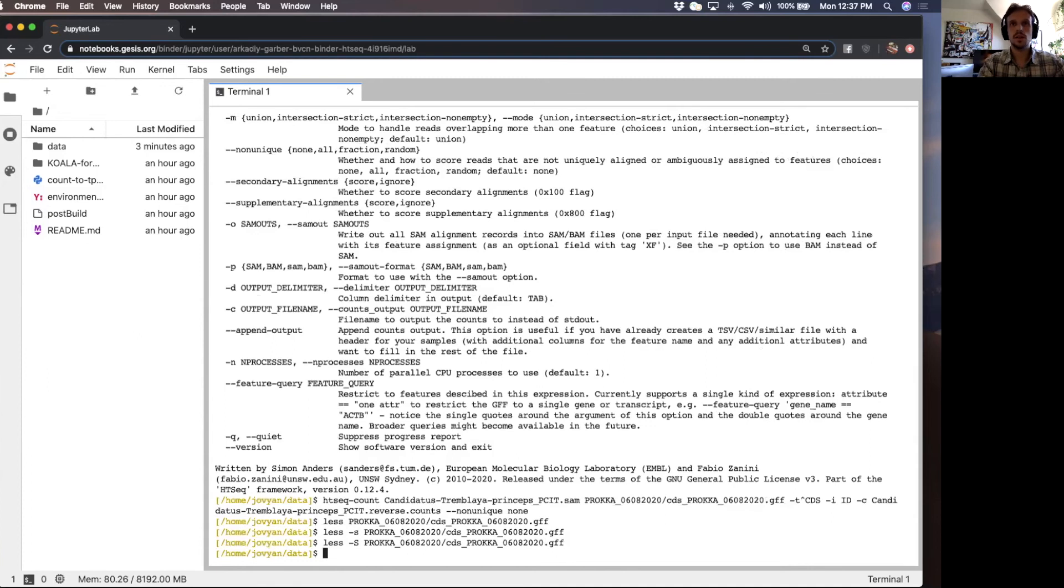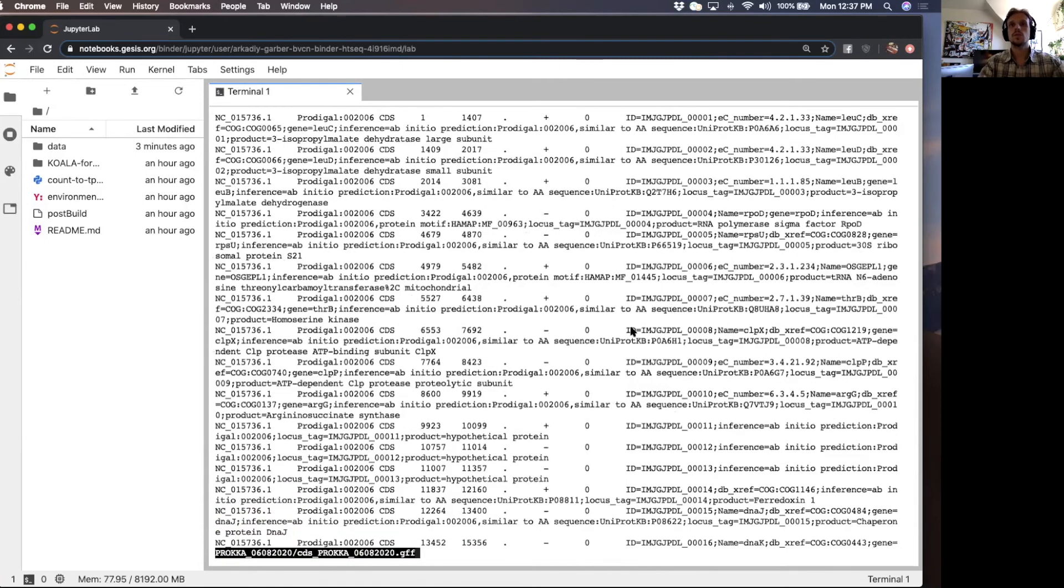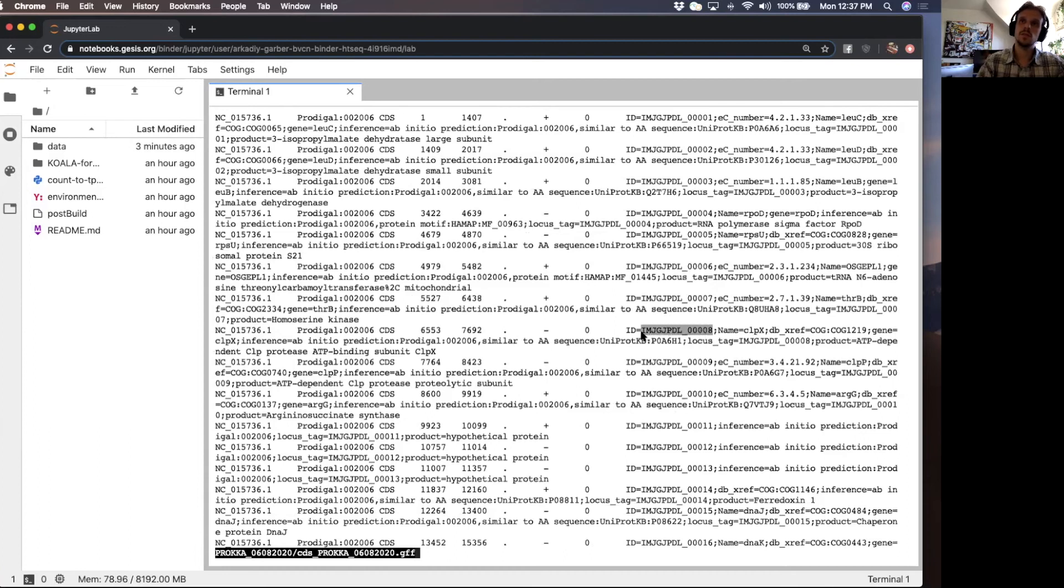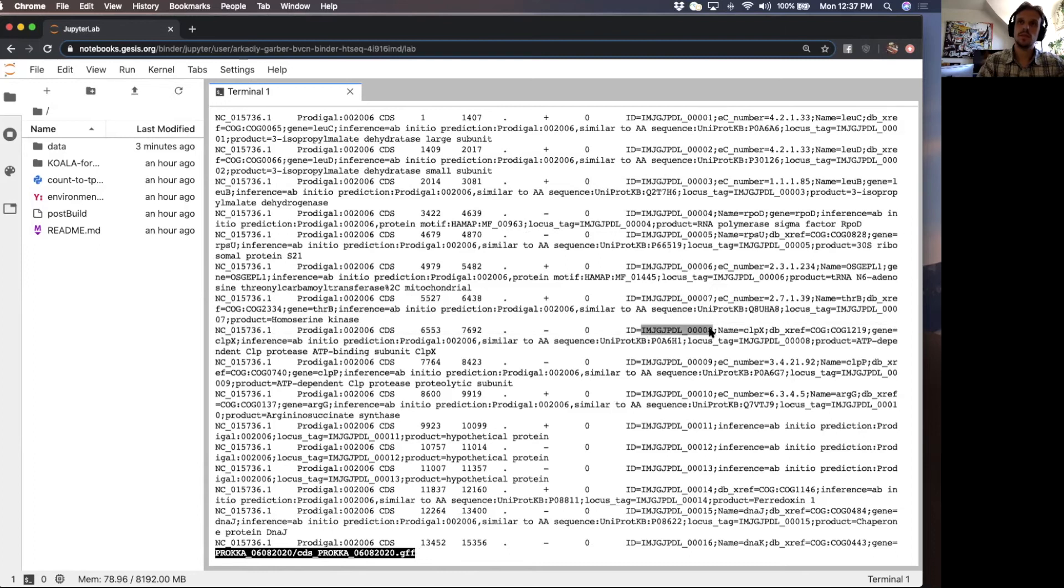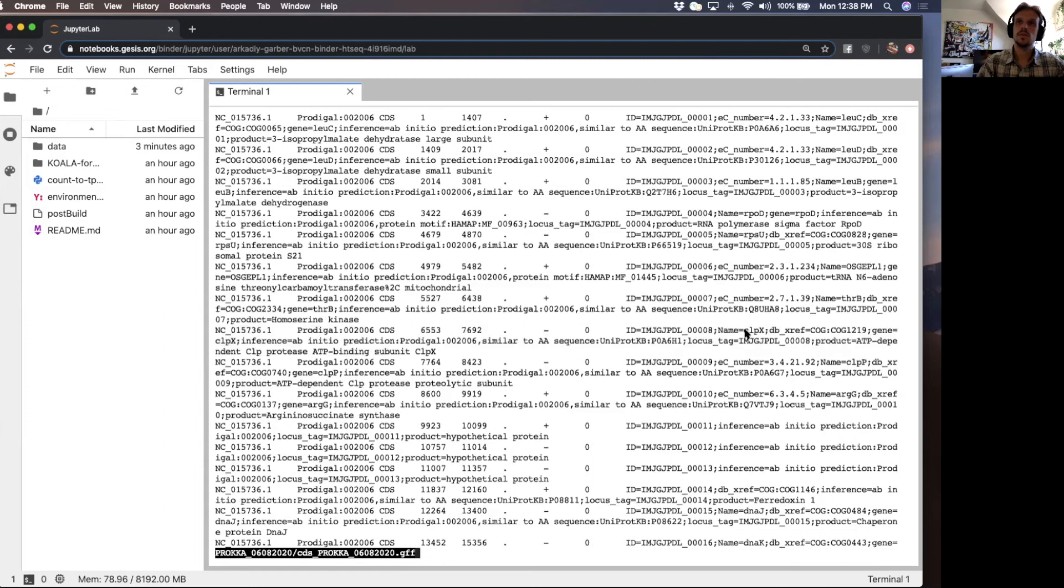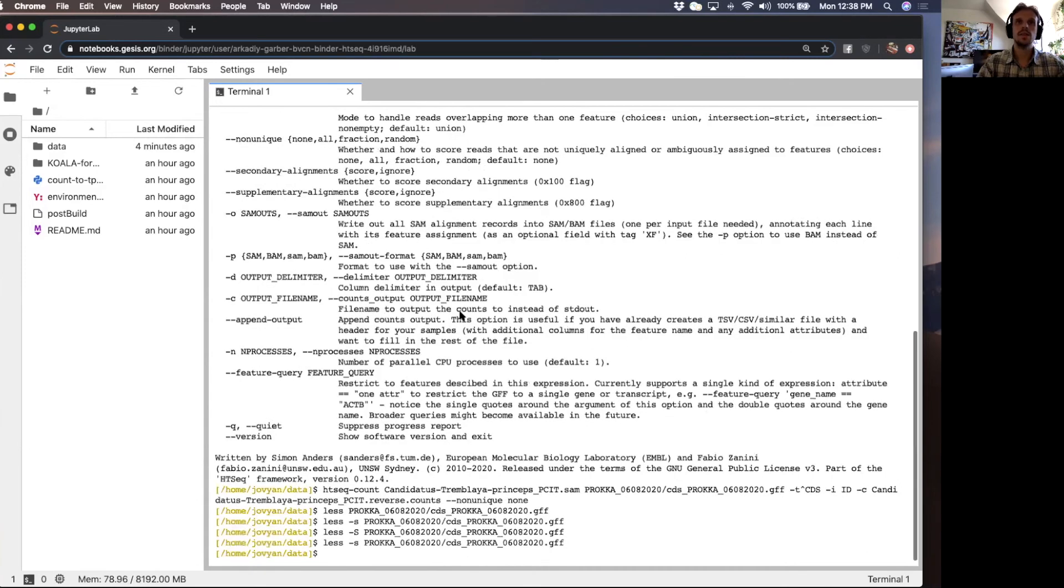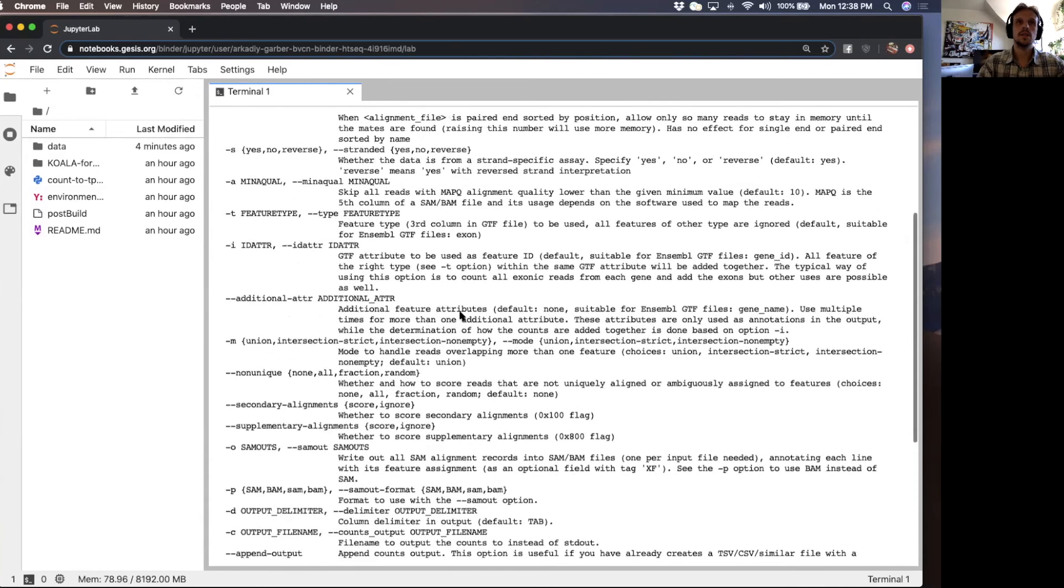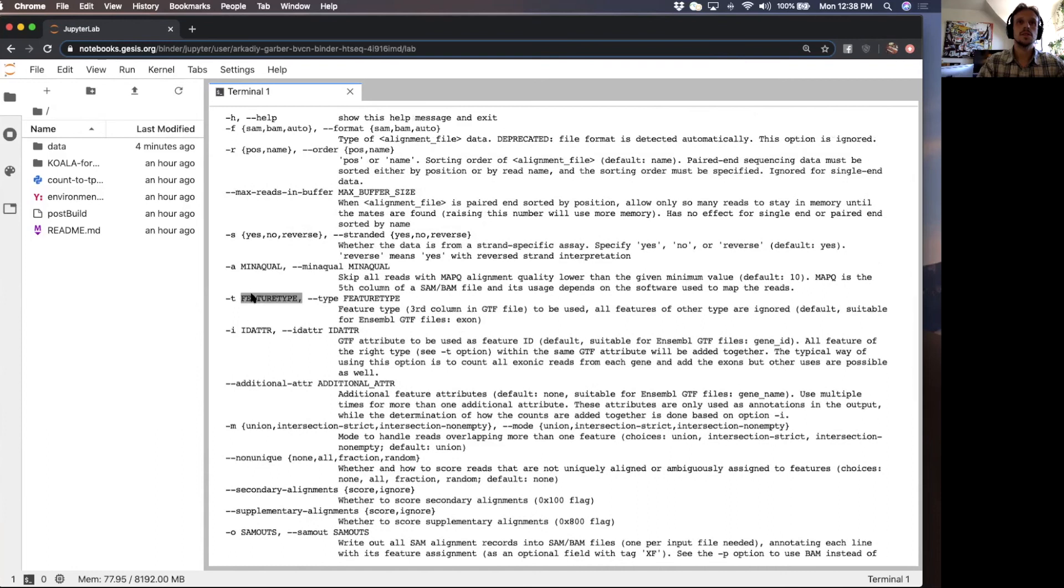The way to know which attribute you want to use is you want to give it the locus tag because that's what it's going to use to create the count table for you. The first column of the count table is going to have these values. If you give it the ID value, if you give it name, then the first column of the count table is going to have this information. You have control over that. And these flags are here, the feature type and the attribute.